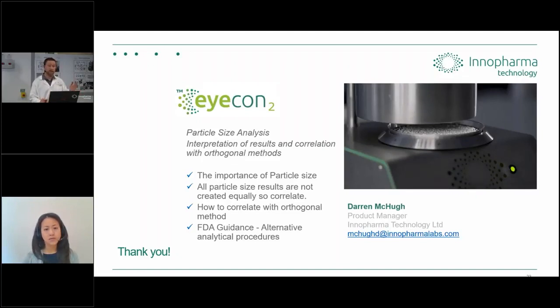The unit comes as standard, let's say, with a laptop, but if it was to be installed inline, we would work with the automation engineers or the IT department to implement it onto their pre-existing HMIs.